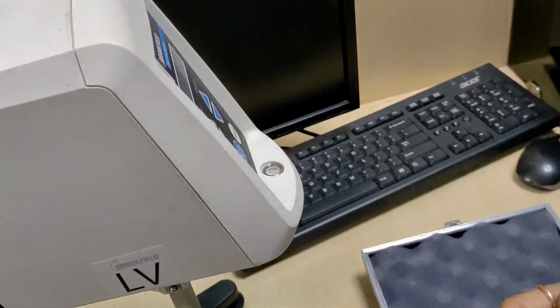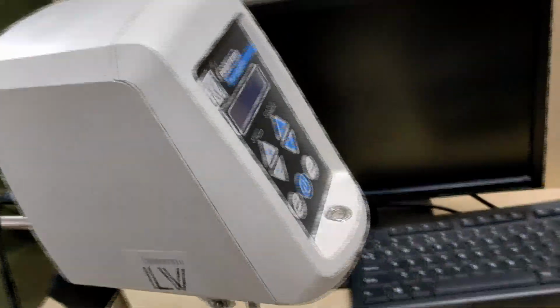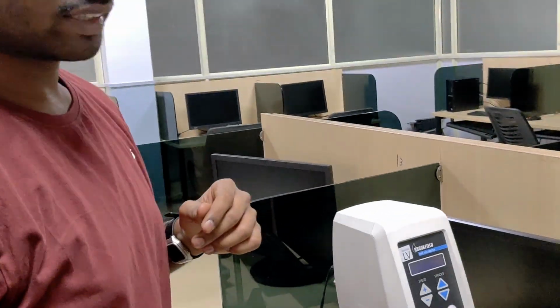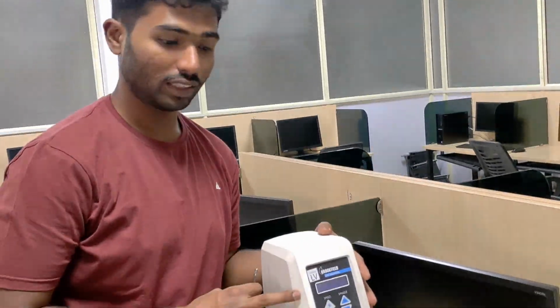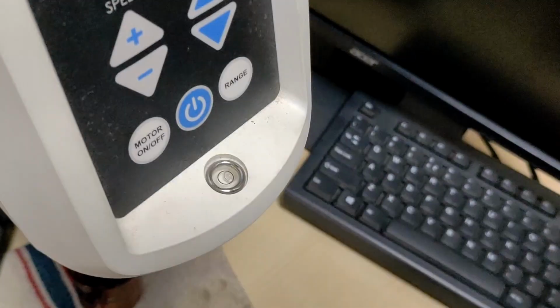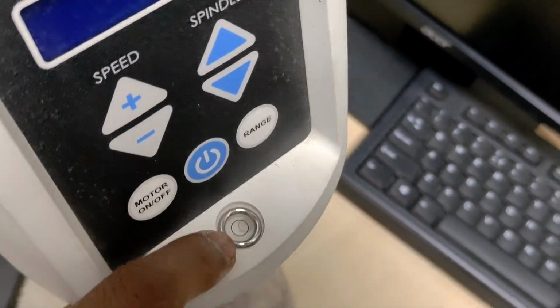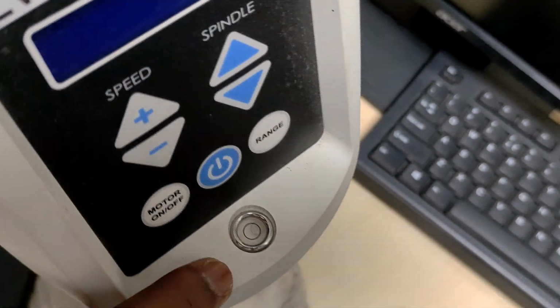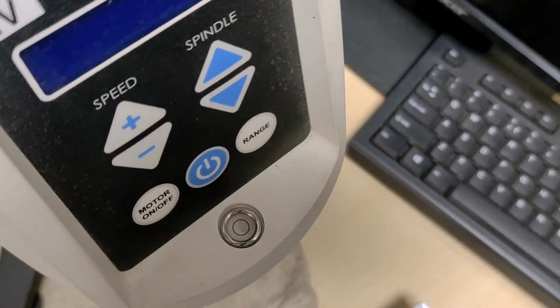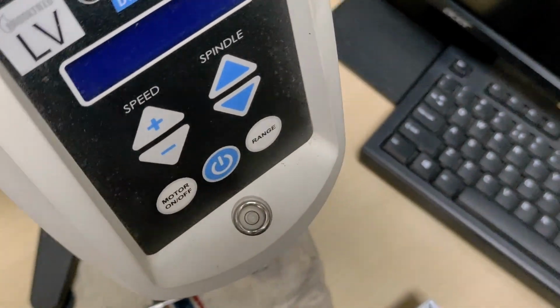So before we connect the experiment, we need to make sure the Brookfield Viscometer is leveled properly. For that, you can see there are two screws here, each one for leveling. There is a spirit leveler here. We need to make sure the bubble is right in the middle, like that.